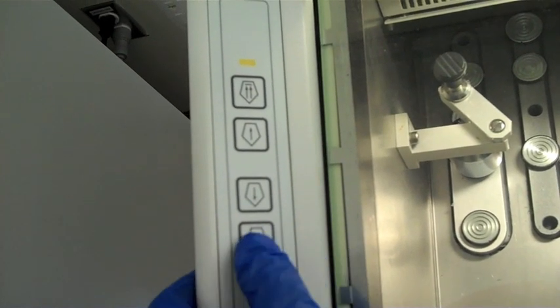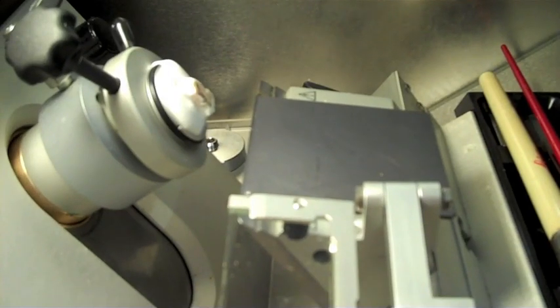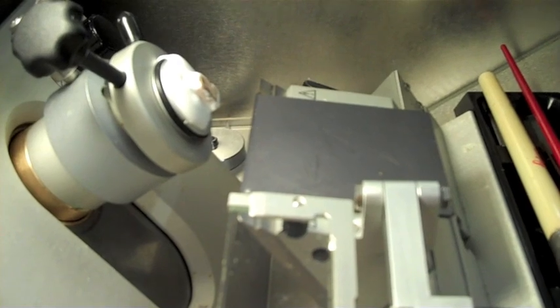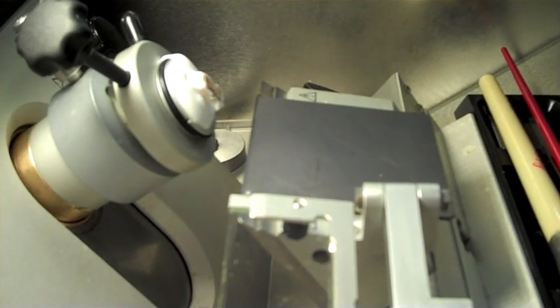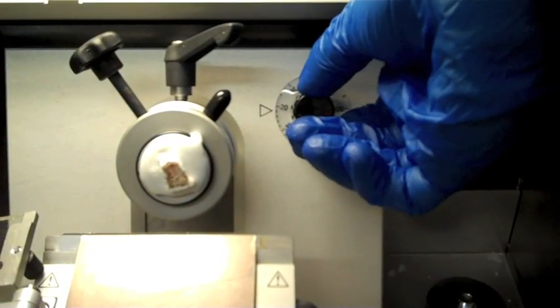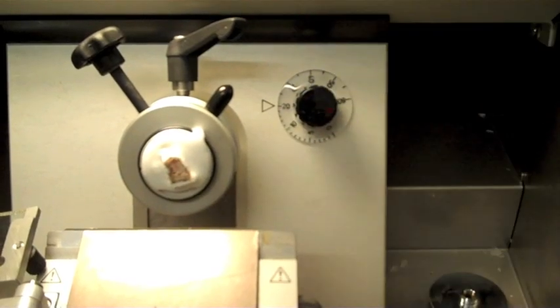Use the arrow buttons on the left control panel to bring the specimen closer to the blade. You will start sectioning by rough facing. Set the thickness of your slides to 20 microns.